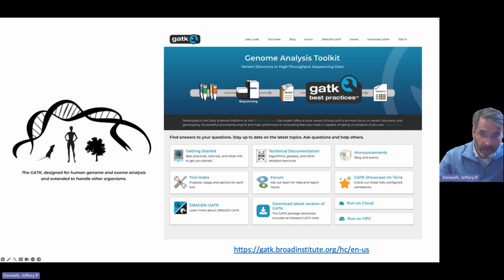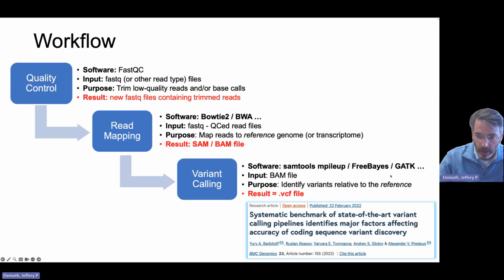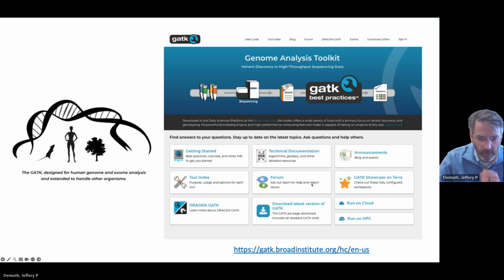Just one word on GATK, the one that I mentioned here. It is really a software suite, not just a variant caller. It is becoming one of the most widely used, but it's so comprehensive that it's just a little too much for us to bite off for this course. But I've given you links. It has its own variant caller. It has basically all the steps that we have done and will do built into one umbrella package, which is the Genome Analysis Toolkit. Just wanted to bring that to your attention.